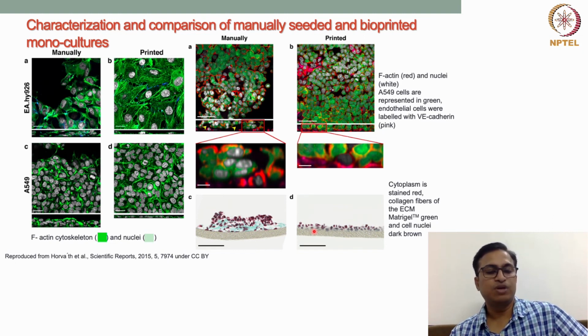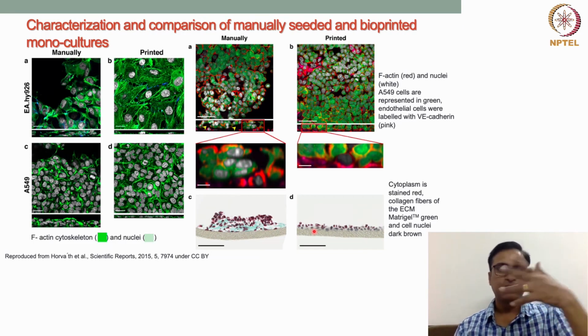So from this study we can understand that the bioprinting technique can be very well used for creating this kind of barrier structure where the cells are present across the basement membrane.